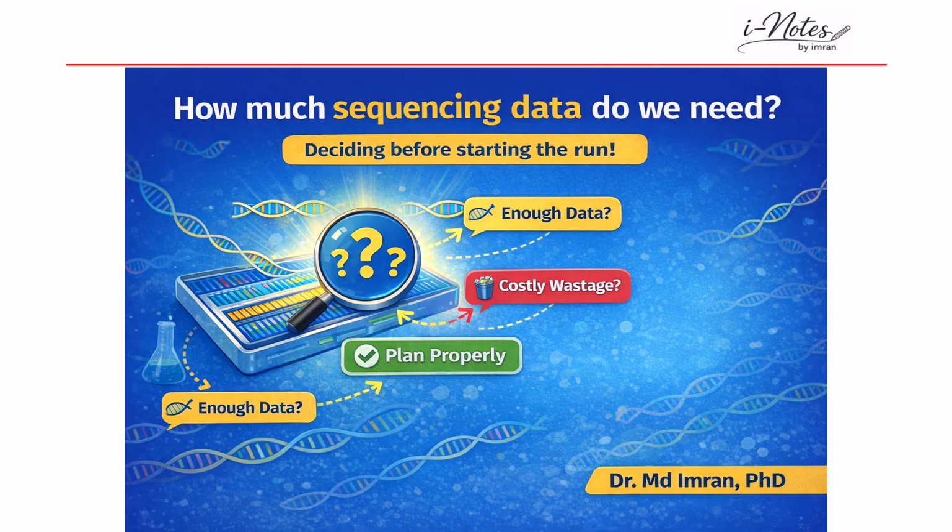So based on my experience of being a student of genomics, I would like to tell you that for setting up a sequencing run, it is very important to plan the run. For successful sequencing run planning, there are several things one has to take care of, but knowing the right amount of data which needs to be generated from a sequencing run is very important.